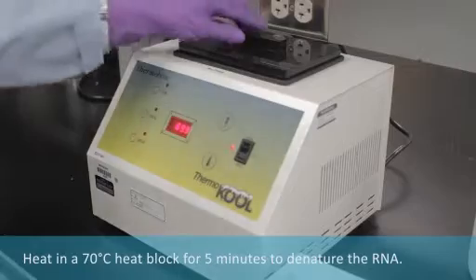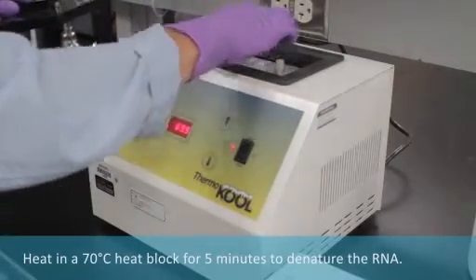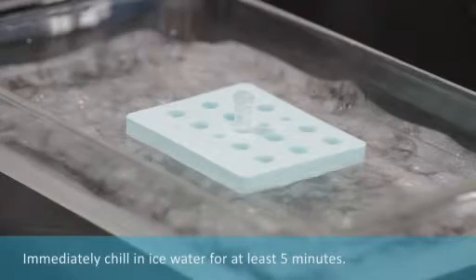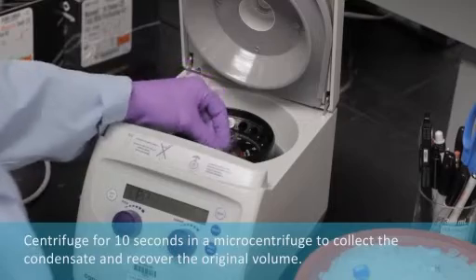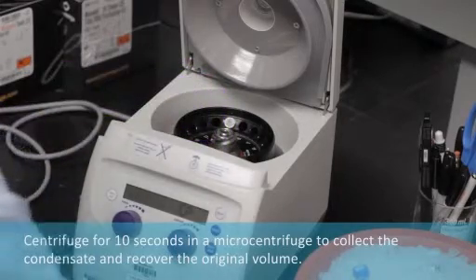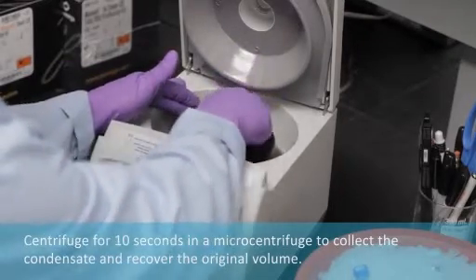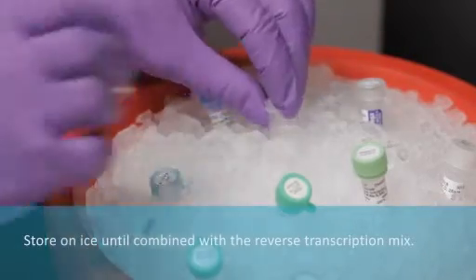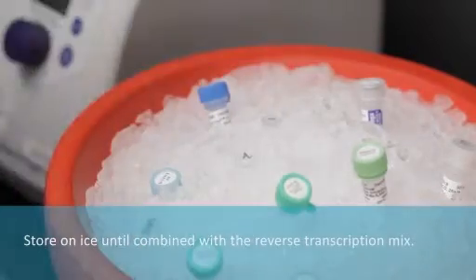Add nuclease-free water for a final volume of 5 microliters. Denature the RNA in a 70 degrees C heating block for 5 minutes. Immediately chill in ice water for at least 5 minutes. Centrifuge for 10 seconds in a microcentrifuge to collect the condensate and recover the original volume. Keep on ice until combined with the reverse transcription mix.